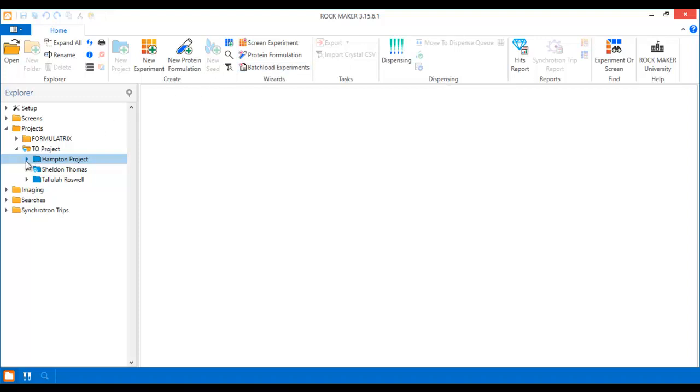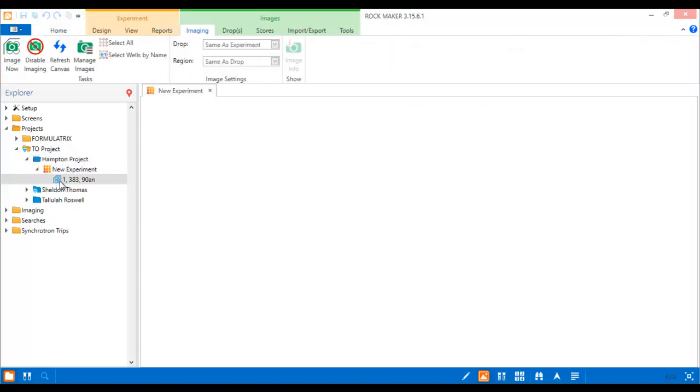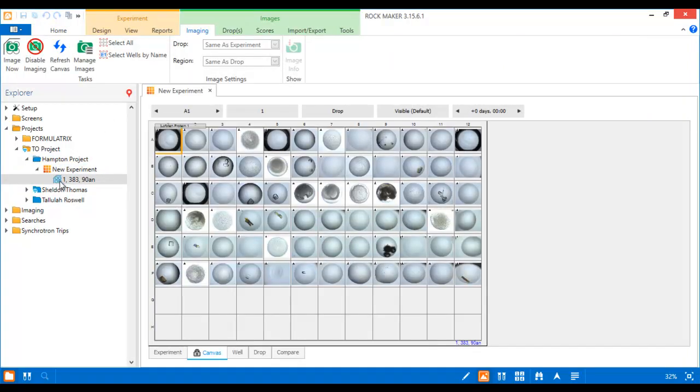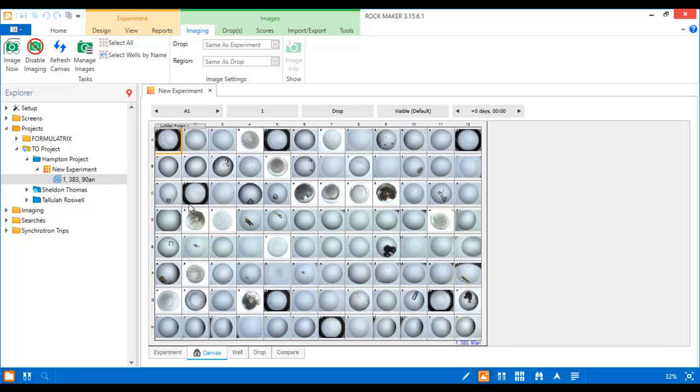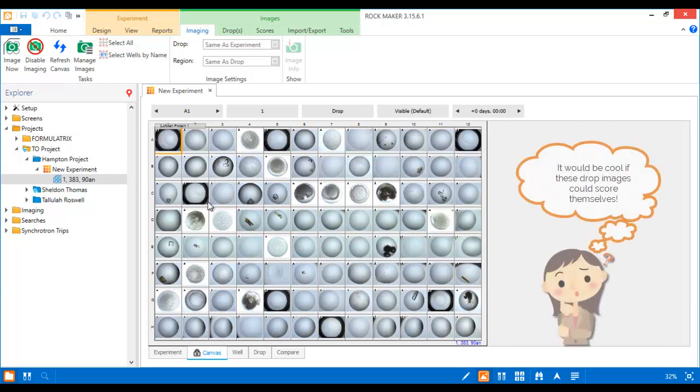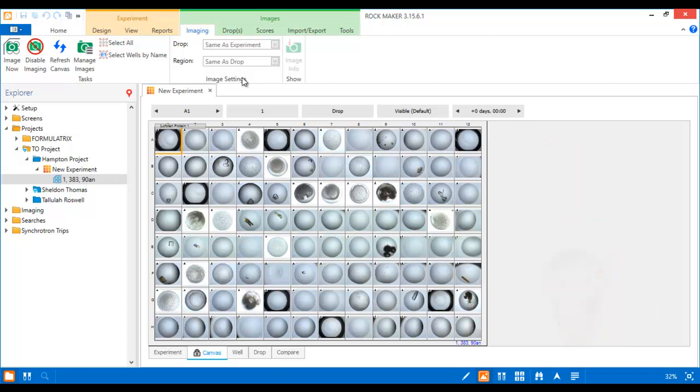Scoring your experiments can quickly become monotonous and time-consuming, stealing your focus away from more important aspects of your work. Just think of all the time you could save if Rockmaker could score your images for you.